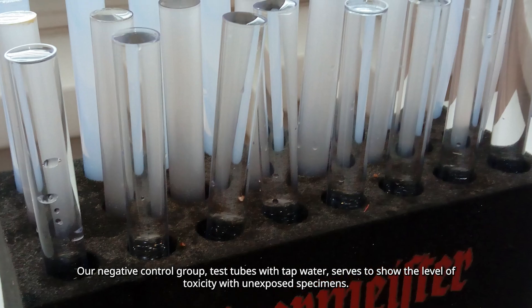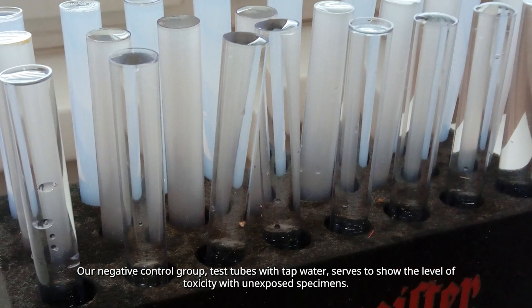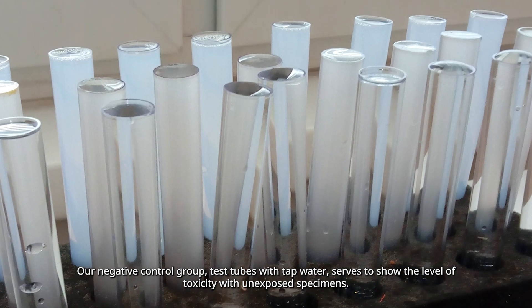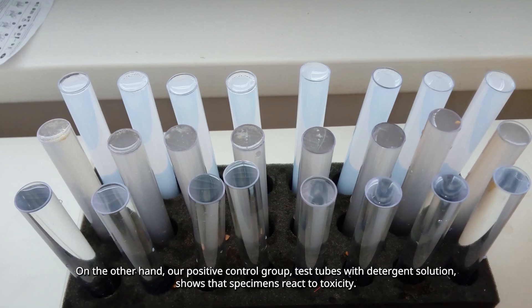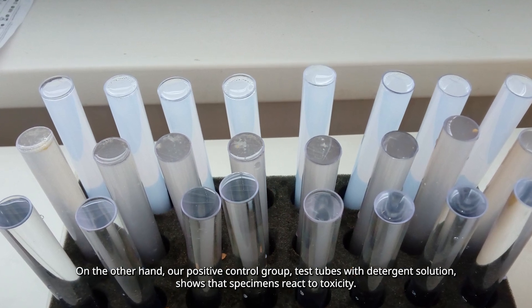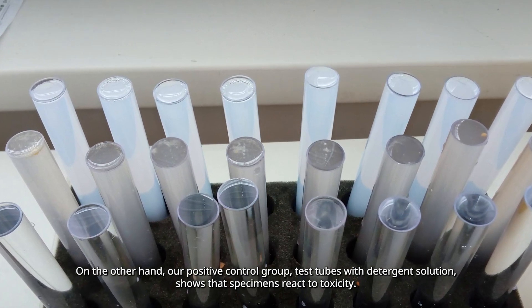Our negative control group — test tubes with tap water — serves to show the level of toxicity with unexposed specimens. On the other hand, our positive control group — test tubes with detergent solution — shows that specimens react to toxicity.